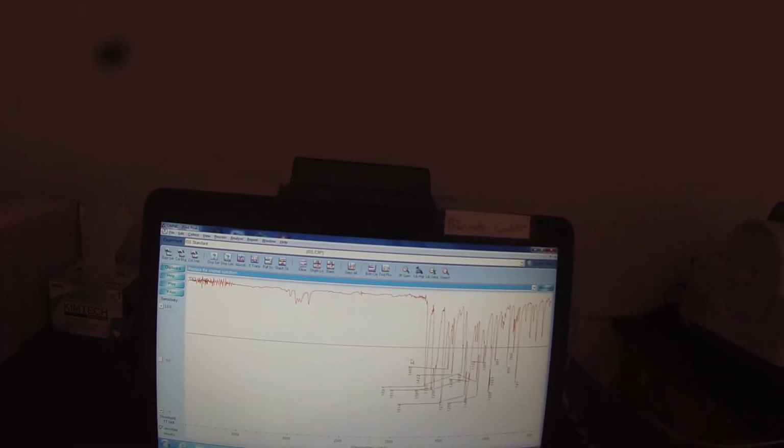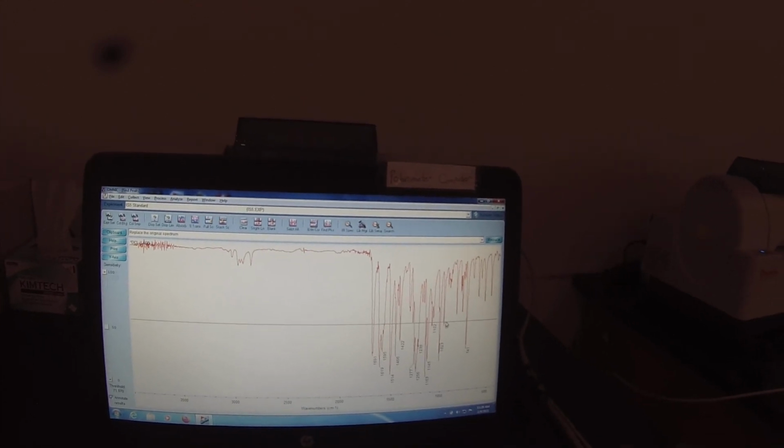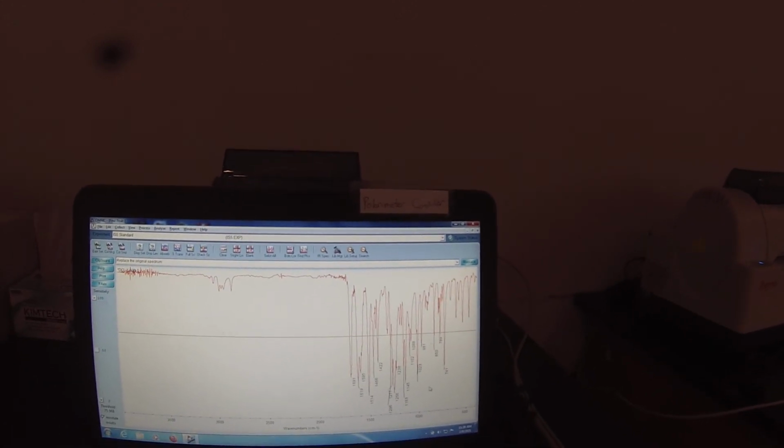And then I will find peaks. There are a lot of peaks in this region. I probably want that one, but I probably don't want all these little ones. I do want these, but I'll label those separately. I don't think I want those, but maybe I do. Well, yeah, let's get those two. But you'll see if I go down too low, I'm getting all kinds of peaks I don't want. Peaks in the 400 to 600 range are generally not of great interest. So that's probably all the peaks I want.